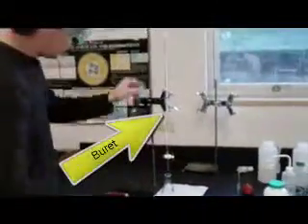We're going to demonstrate for you now how to actually conduct a titration experiment. Now, this is very, very important because you need to know how to do it for a lab, and you also are going to do this on your final project. So it's very important that you get all the details of what's happening here. First, we're going to introduce you to the equipment that you're going to be using. This is called a burette, this tall, skinny device here.